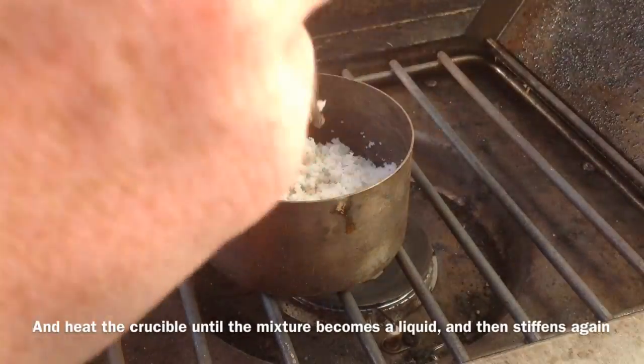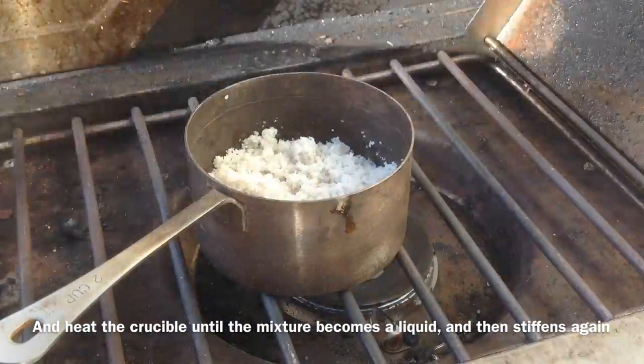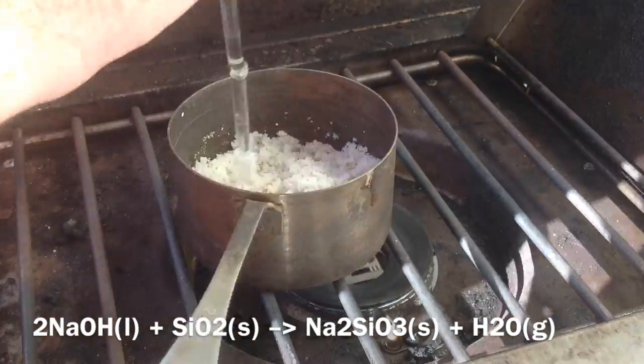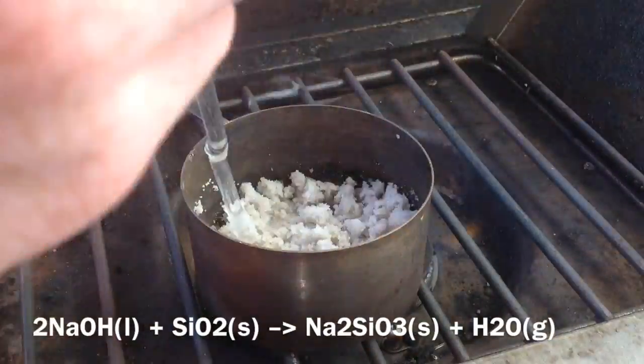Next we heat it up, making sure it gets above 330 degrees Celsius so the sodium hydroxide can react with the sand to form sodium silicate. We'll explain what we do with that to form silicon dioxide shortly.